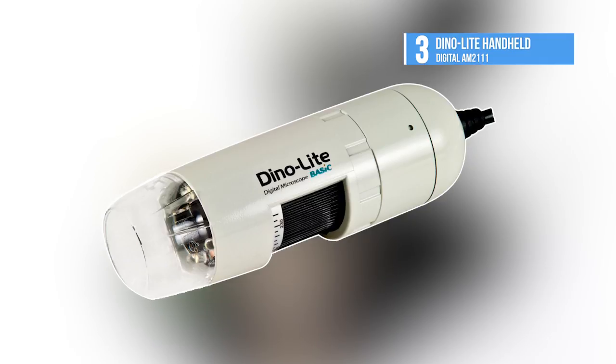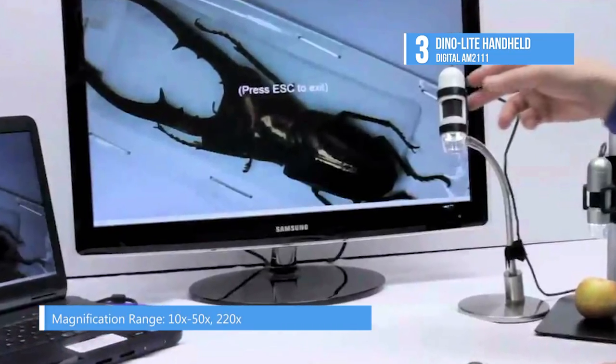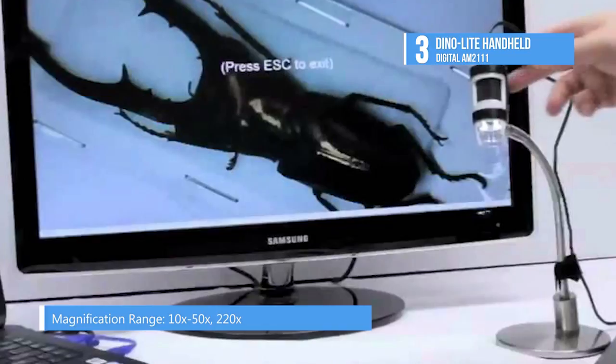Next up at number 3 we have the DinoLite Handheld Digital. The DinoLite Digital Microscope is an amazing and easy-to-use handheld microscope. It is ideal for various applications such as skin check, scalp check, science learning, visual assistance, and industrial inspections.